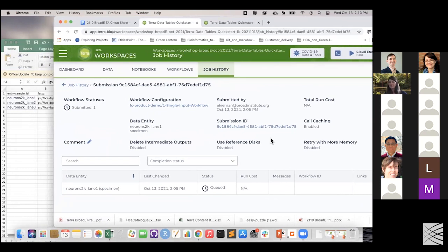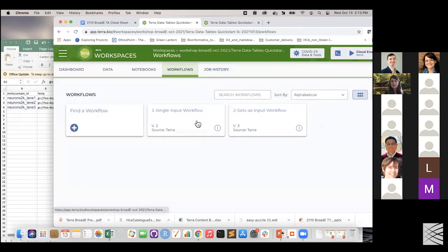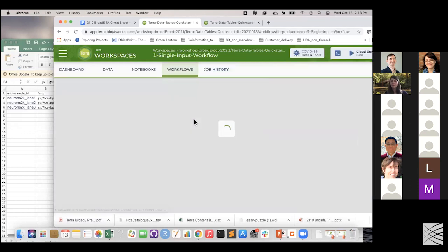Or you can feel free to paste any failure message that you got in the chat, and we can talk through that and see. Let me just show you all the workflow configuration one more time in case someone was trying to follow along.